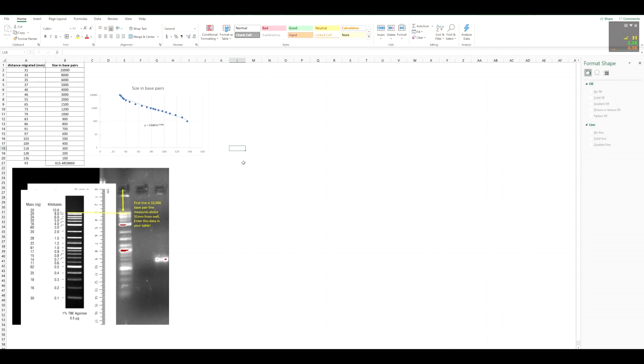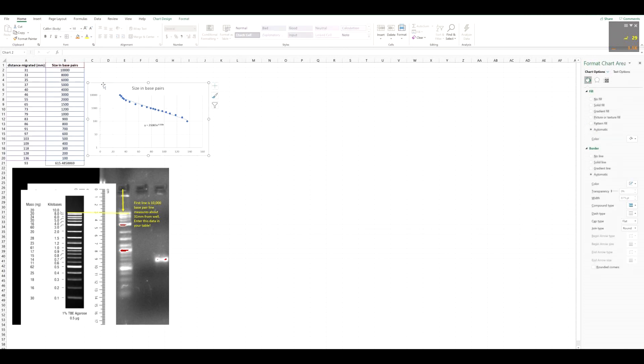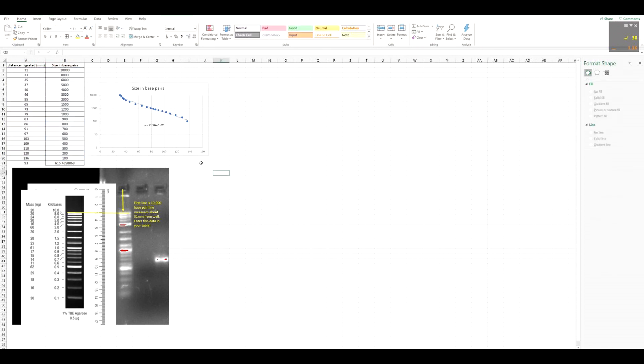That actually sums it up for how to make a standard curve in Excel. From here on out, you can do it this way, and just include these kinds of graphics and tables inside your lab notebook or lab summary. If you have any questions or concerns, feel free to contact me.